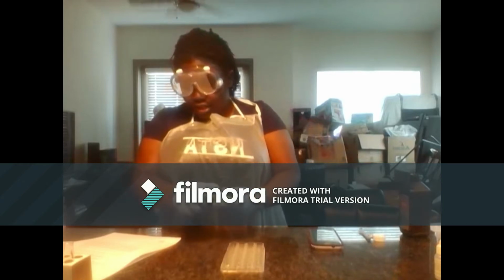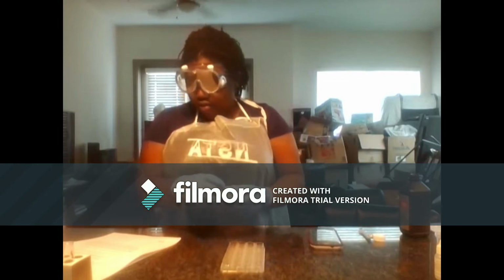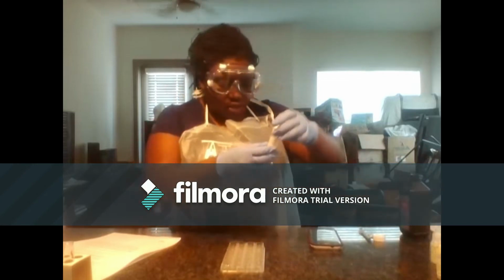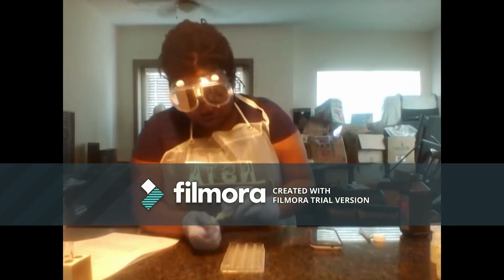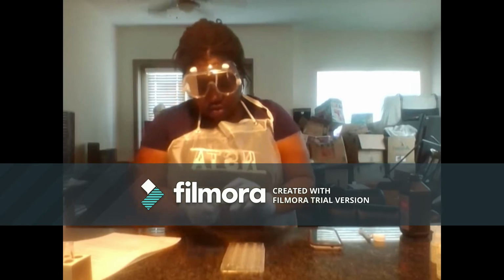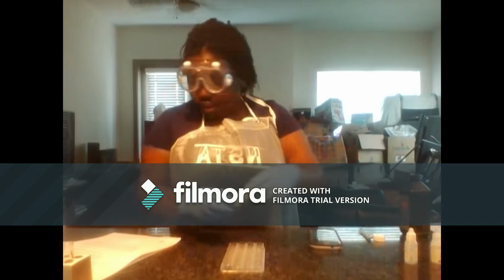And to that I'm going to add 2 drops of hydrochloric acid, and then I will add 4 drops of starch, and 8 drops of sodium thiosulfate.